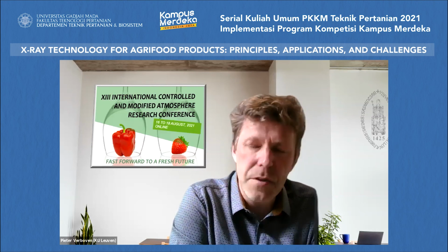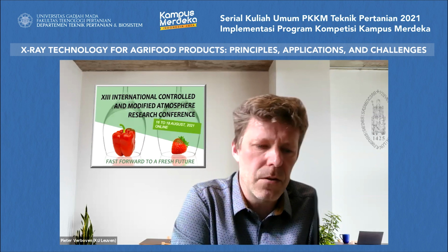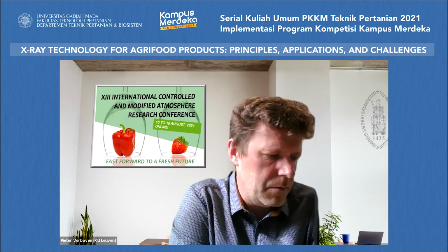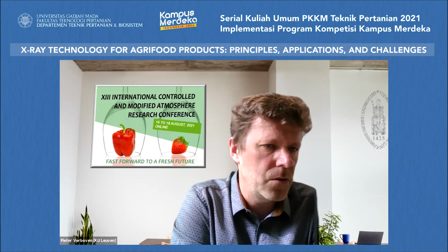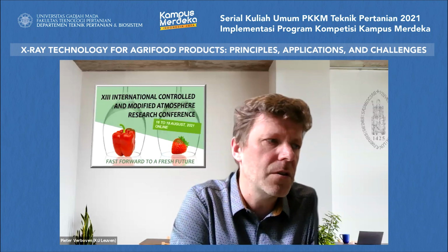So yes, it is possible to screen batches of seed with X-ray technology for their morphological parameters that can be related to seed vigor, or in your case, maybe dormancy and so on.